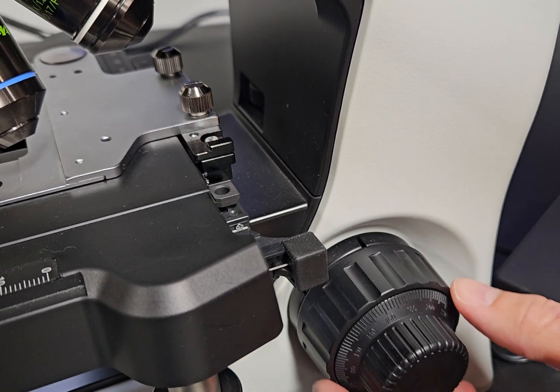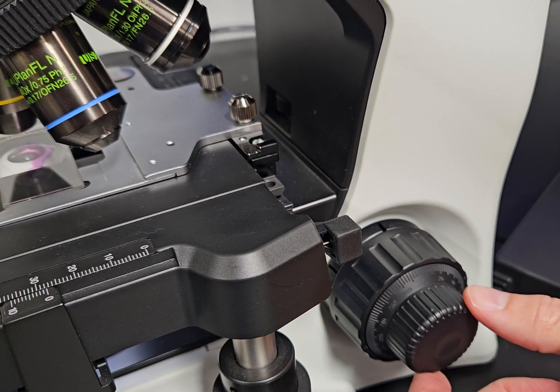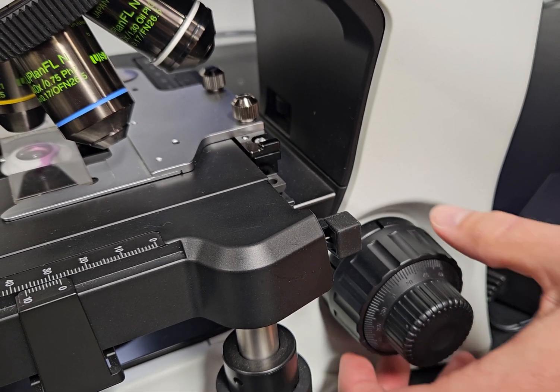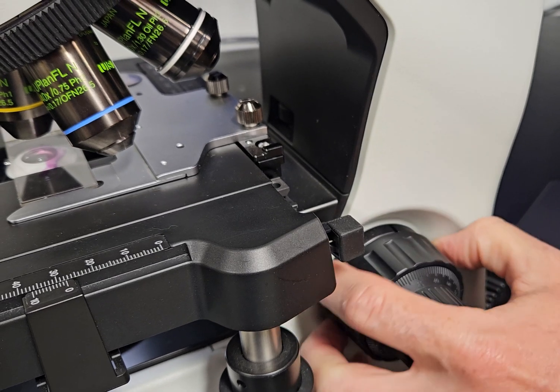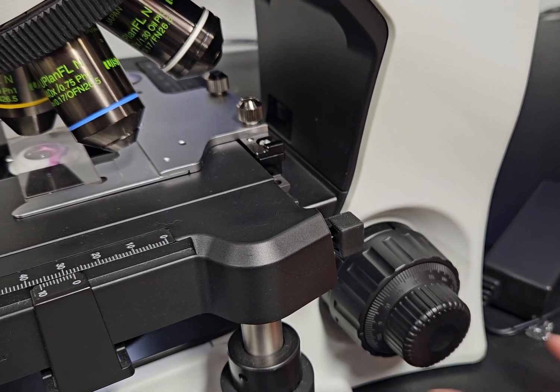This right here, if your scope is drifting, in other words if this is rolling without your hand on it, without turning the knob, sometimes you need to tighten this ring up on the inside. Turn it towards the wall and it'll correct that issue.